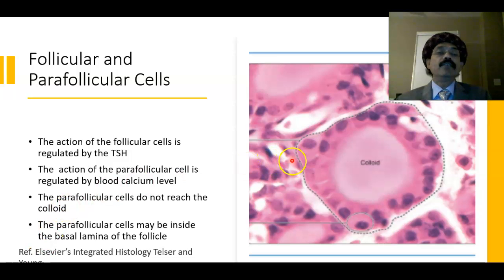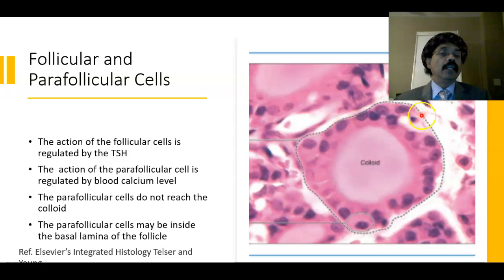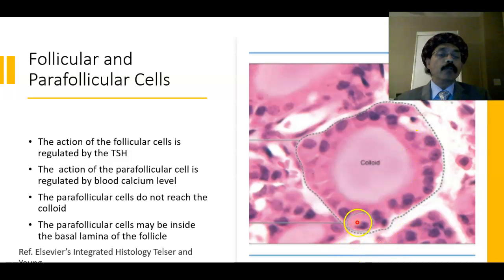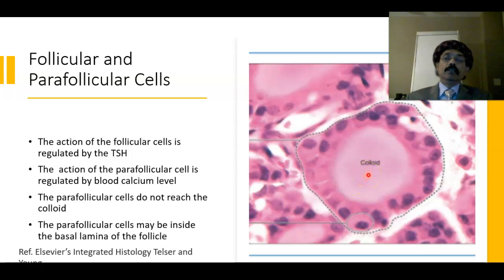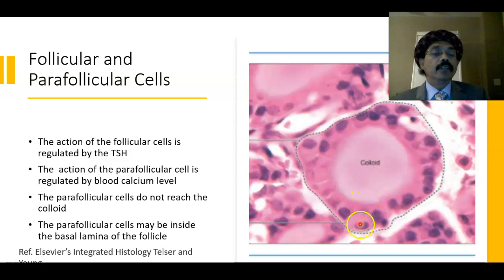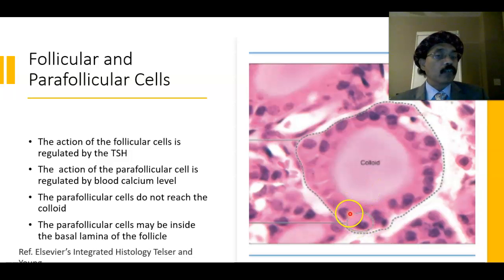Here is another follicle of the thyroid gland, lined by simple cuboidal epithelium. Here is a parafollicular cell inside the follicle, within the basal lamina. Note that the parafollicular cell does not touch the colloid — it is covered by the follicular cell and separated from the colloid.